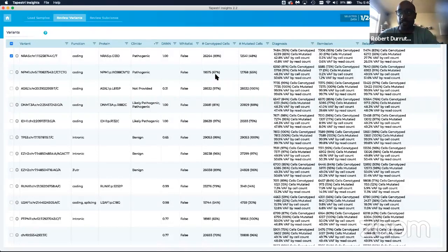And this has to do with a number of factors, including this particular variant residing in a very GC-rich region. We'll have a separate section on that in about 3 weeks, I believe, where we talk about potentially missing variants and how to go about retrieving them. And so the fraction of those 67% that is mutant is 65%, again, well within the territory of somatic mutant. And as you can see, again, similar to NRAS, you see this dynamic change from 91% down to less than 1%, up to about 91% again.